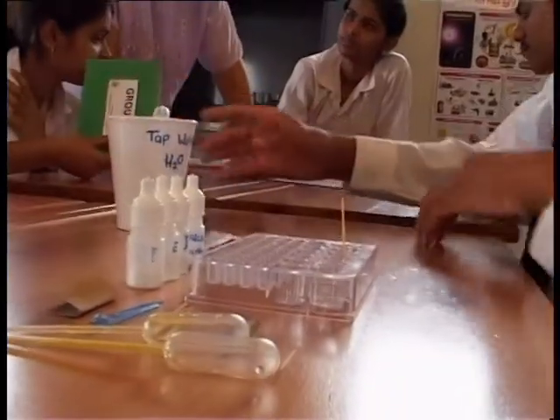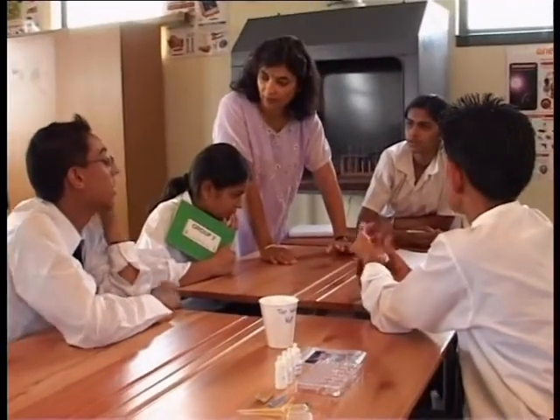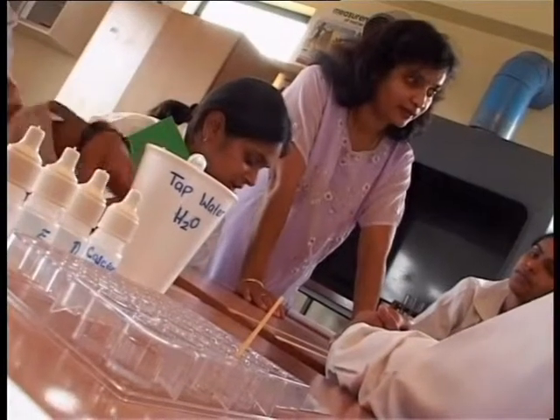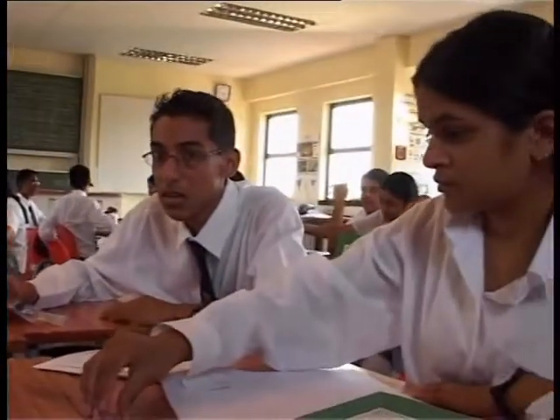In this part of the practical, 2 aqueous solutions will be tested for acidic behavior. Here, the learners are not following instructions from the worksheet. They are planning how to do the investigation themselves. Where's test 2?